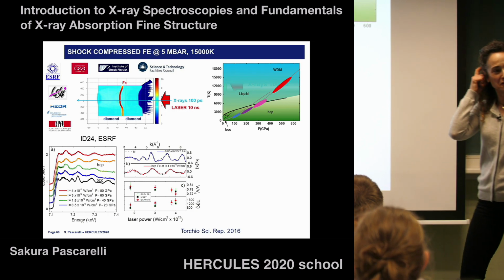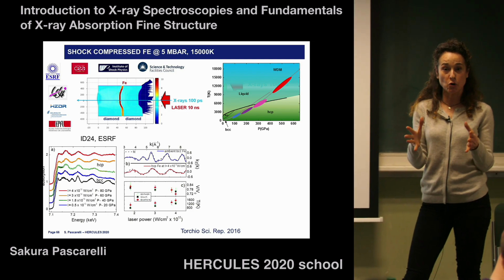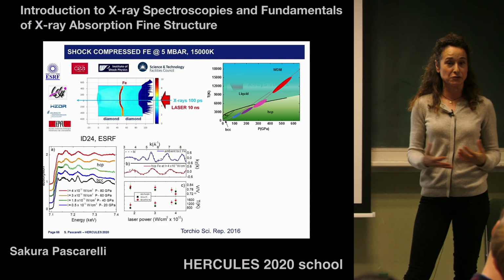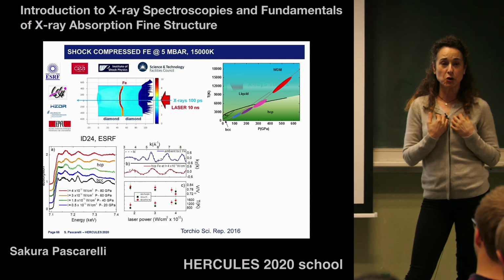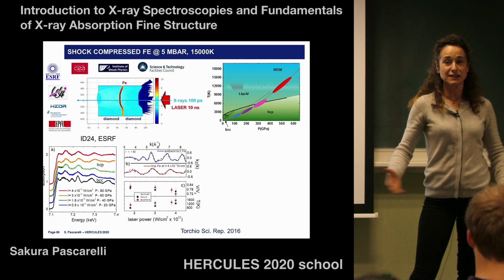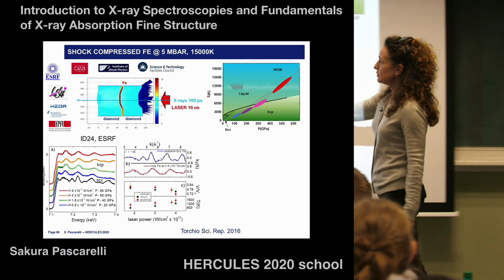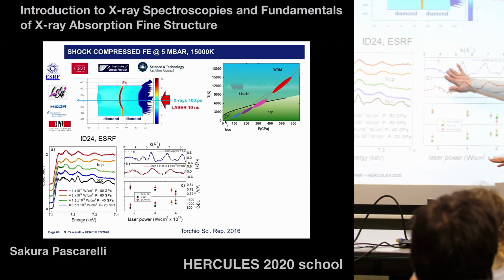But if you come in 2 years, then you can come and do experiments. Actually, I hope that many of you will be interested in doing this stuff, because we need you guys, right? I'm getting very old. Everybody's getting old, and we need new people to come and do this stuff. So you see, you can get this with a single shot, and then you can analyze the data.